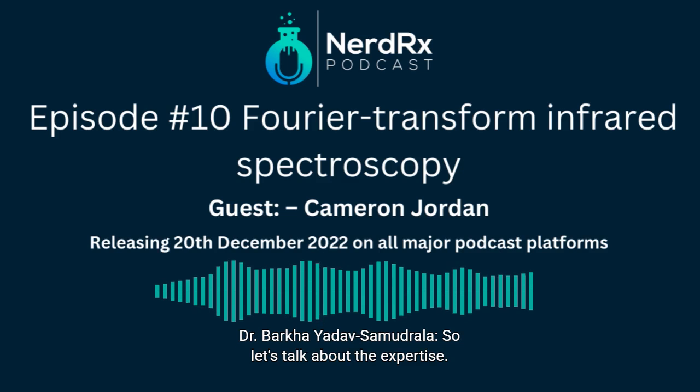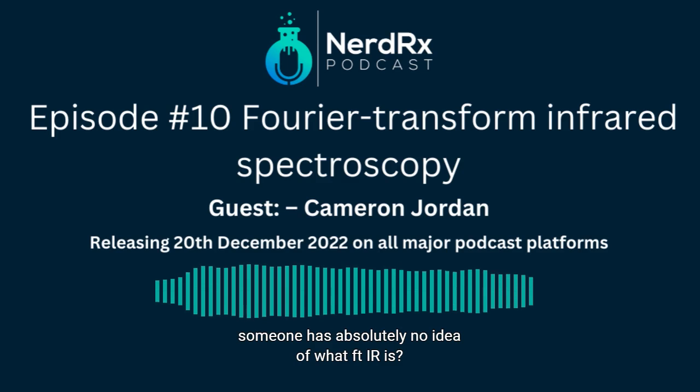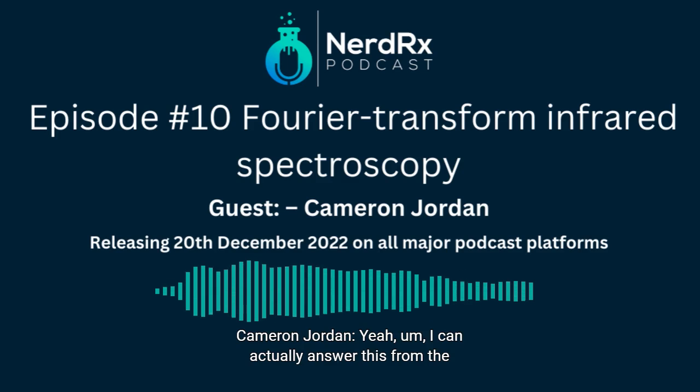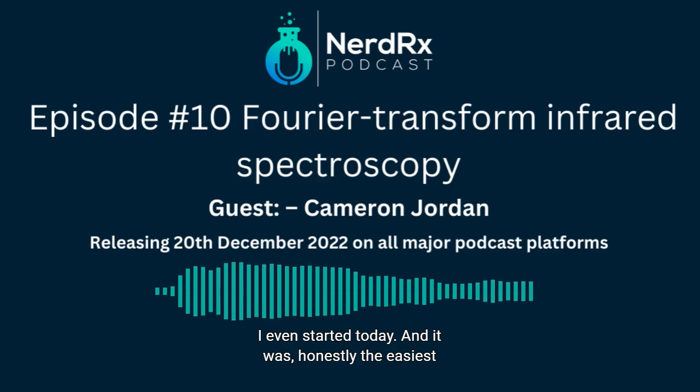So let's talk about the expertise. Is it an easy technique to learn for a completely newbie, if someone has absolutely no idea what FTIR is? Yeah, I can actually answer this from the side of a newbie because I had no idea what infrared was before I even started.